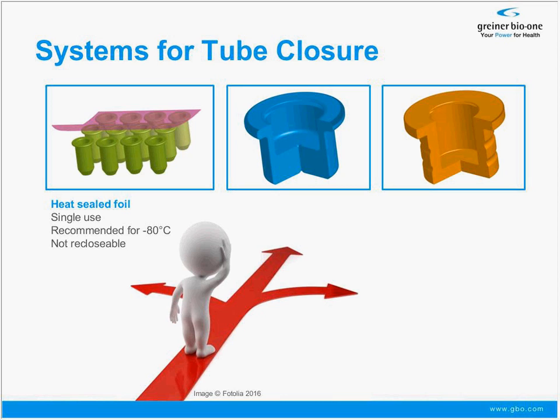The center, I said, is the push cap or the silicone plug, also possible to be used for closure of biobanking tubes. This is a rather common and widely used system. It is reclosable, so this is one feature that is added now. Still, it's only recommended for temperatures down to -80 degrees Celsius. The seal you would form here is, however, not the exact same quality as compared to a screw cap, which is producing the best seal and is therefore also recommended for long-term storage.